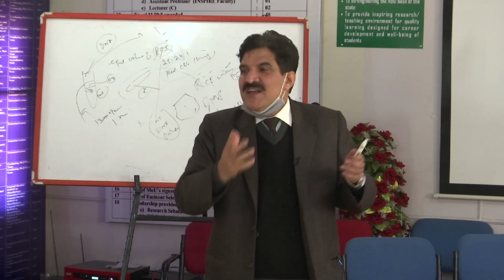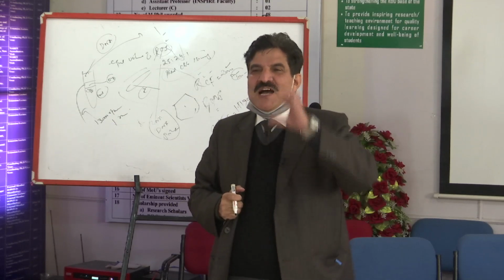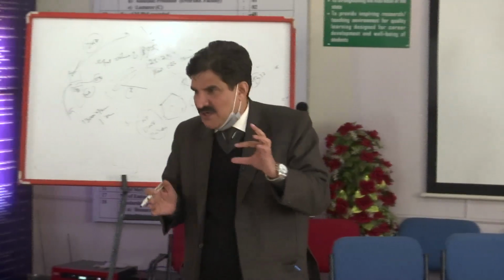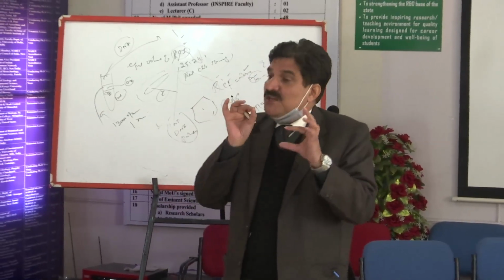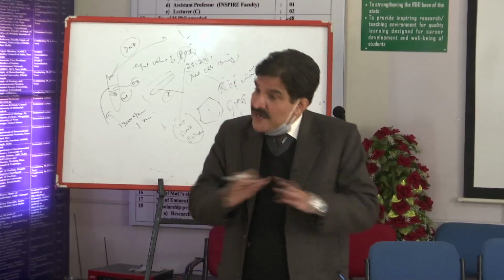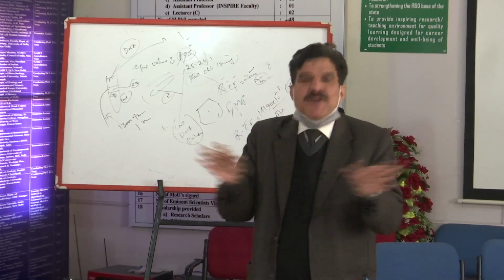If you are still not satisfied, do it a third time, up to three times. After that, whatever is remaining in the aqueous phase contains DNA and all other molecules which are not going into the organic phase, which have not been precipitated out by the phenol. That thing containing DNA and other things, now we are going to have only DNA isolation, and DNA purification, you can say.